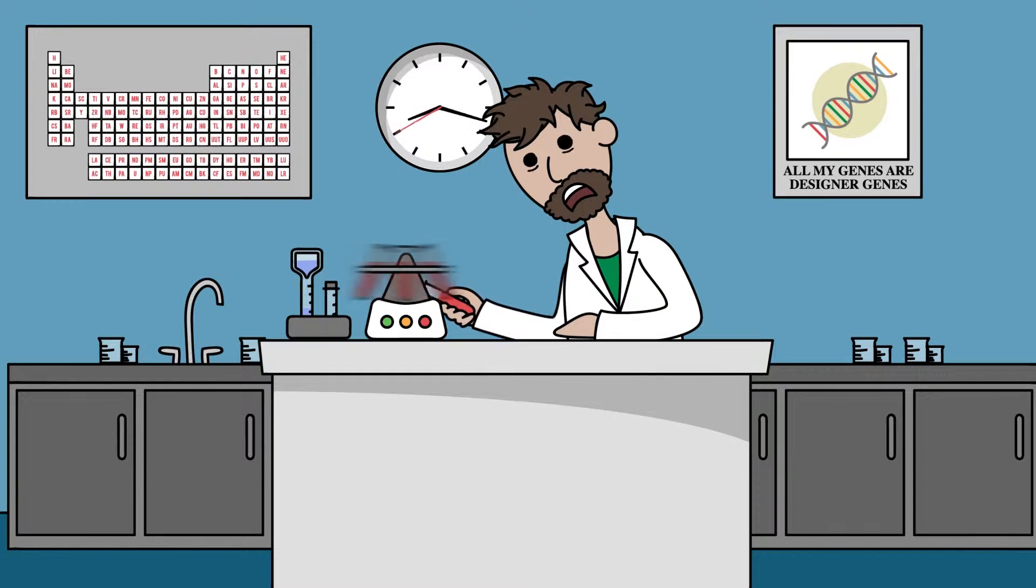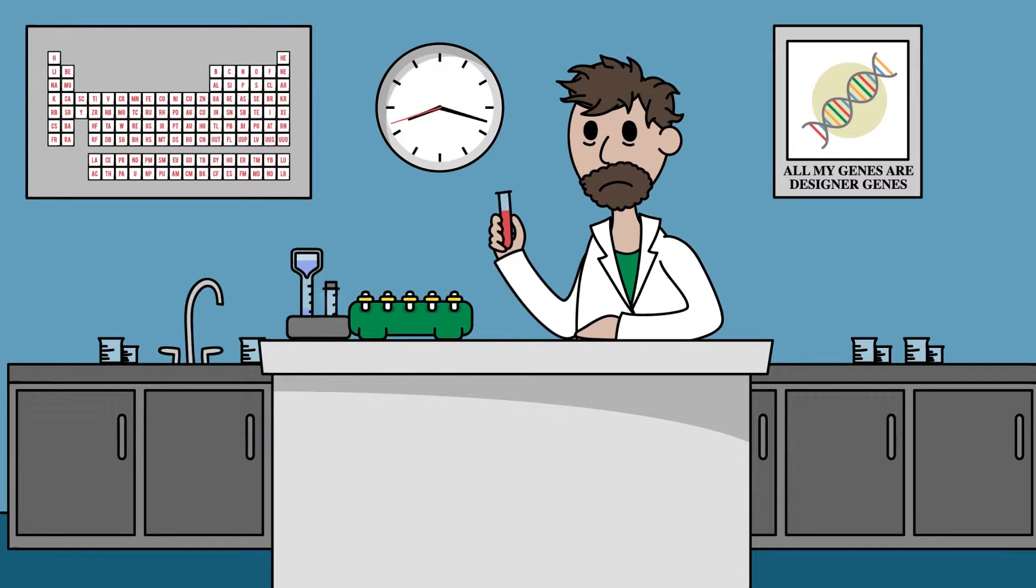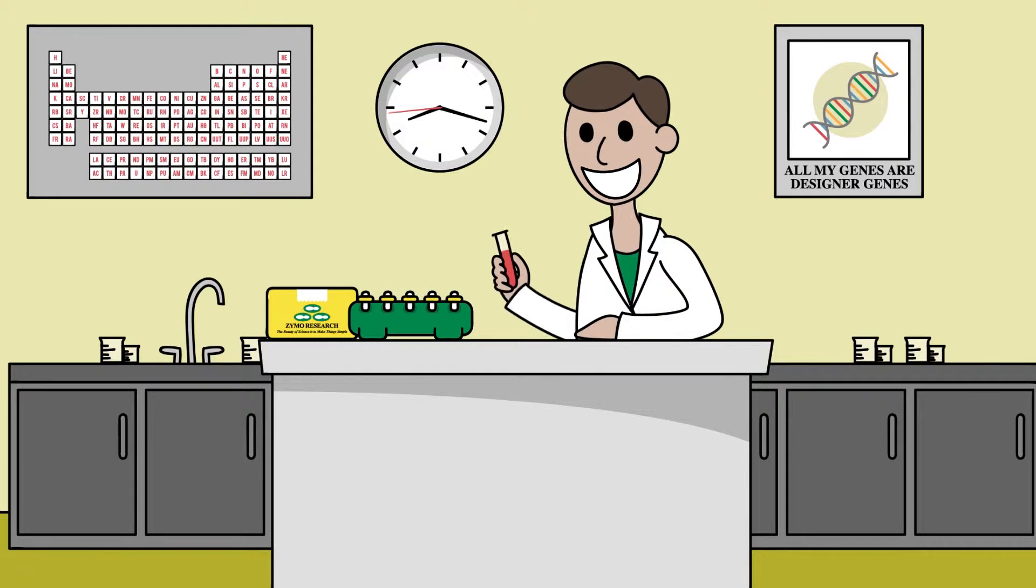Large-scale plasmid purification can take over two hours. With Zymopur, it takes 18 minutes.